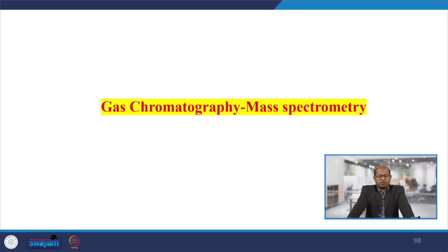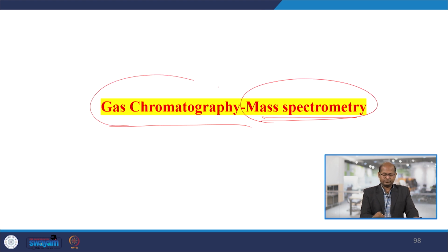Okay. So, in that way components come out one by one, and with the help of detectors we can quantify how much of each individual component is present. This is for simple gaseous components. With gas chromatography we can identify or quantify them, but when larger molecules or liquid molecules are there, with many compounds, with normal GC and a packed column we cannot identify them. Then we have to go for a more advanced technology, that is GCMS.